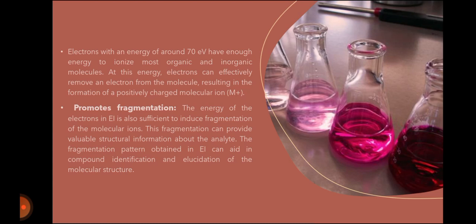It also promotes fragmentation. The energy of the electrons in the source is also sufficient to induce fragmentation of the molecular ion. This fragmentation can provide valuable structural information about the analyte. The fragmentation pattern obtained in EI can aid in compound identification and elucidation of molecular structure.